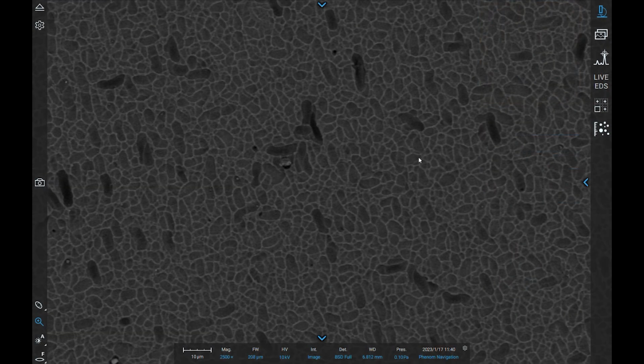When you acquire an SEM image, a large amount of metadata about said image is stored inside of it. This metadata includes everything about the image, including time, detector settings, and position on the stage.